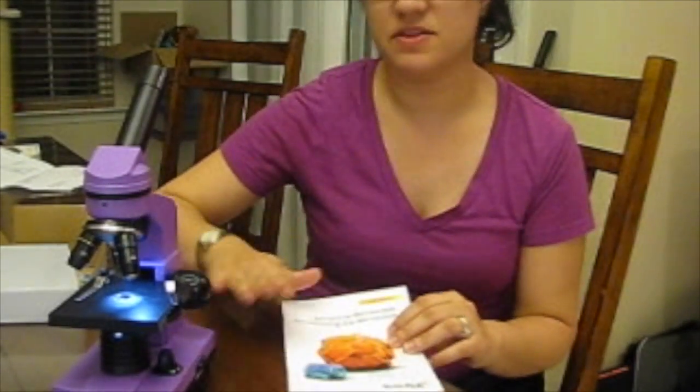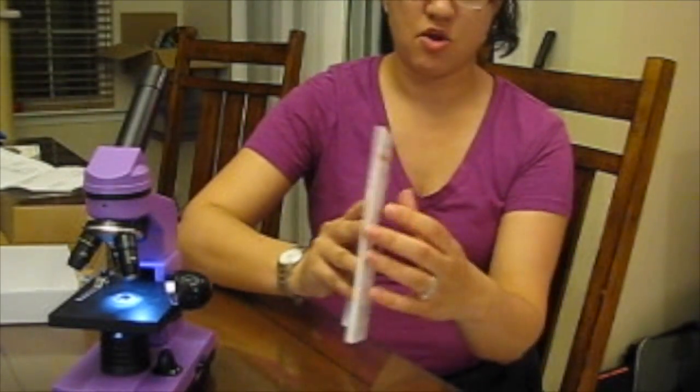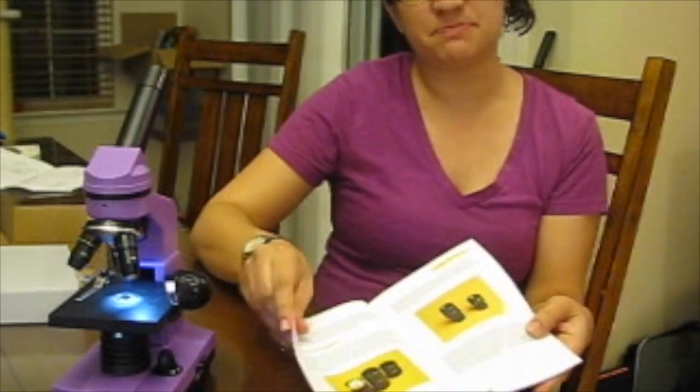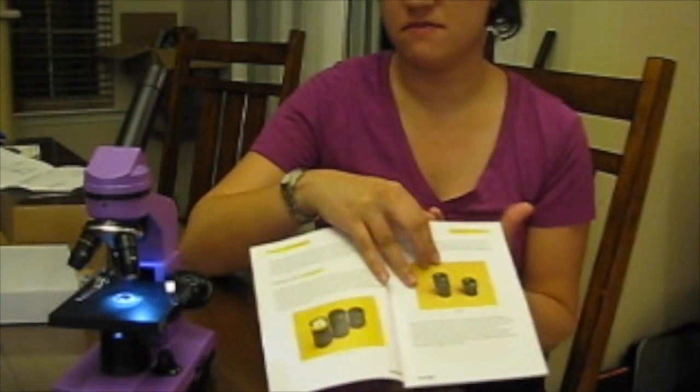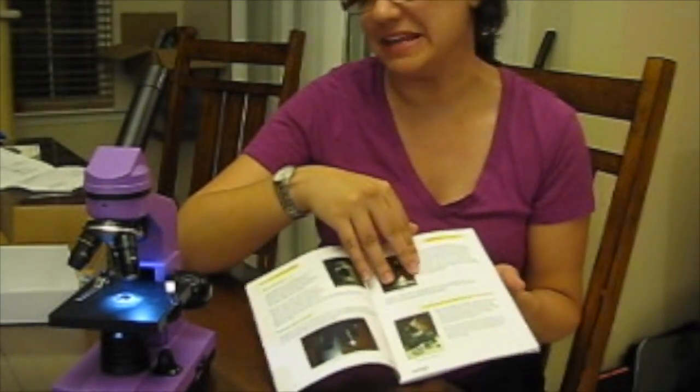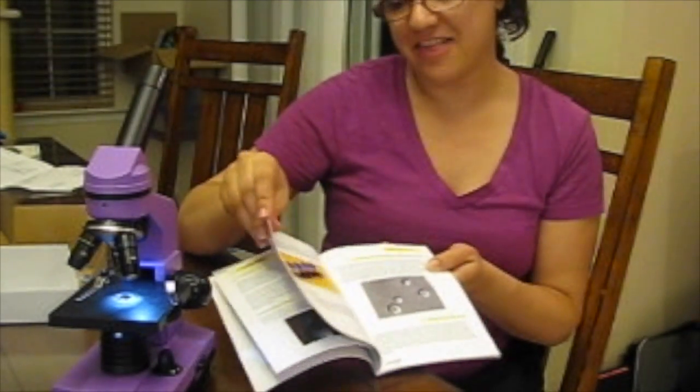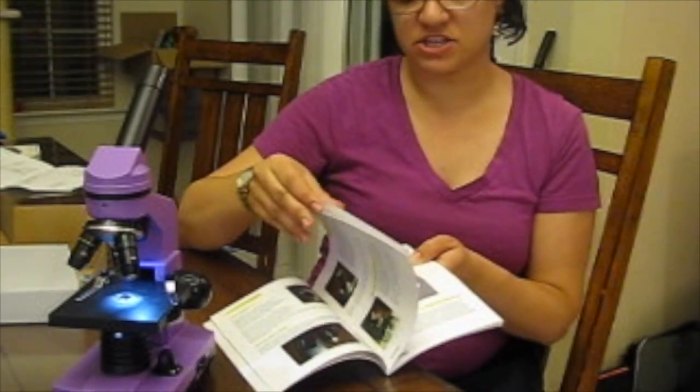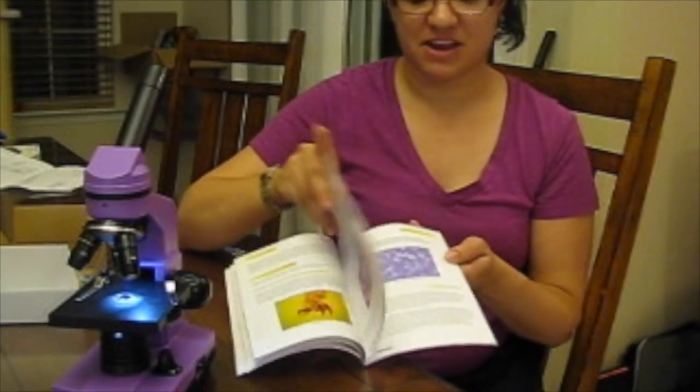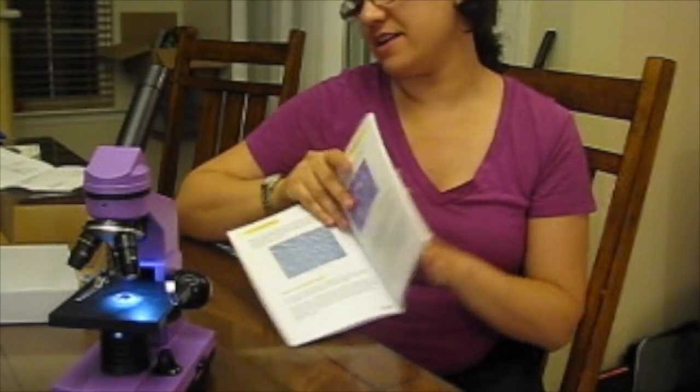So I also really love that this comes with this impressively thick full color booklet that explains all the different pieces of the microscope. So there's information for kids and adults to really understand what they're seeing. And then even better, it walks through a bunch of common experiments that can be done with the other materials that are provided.